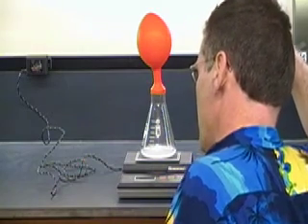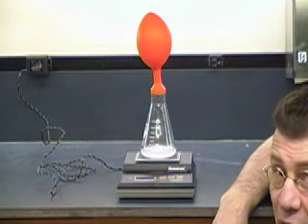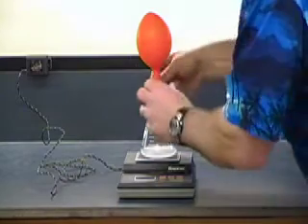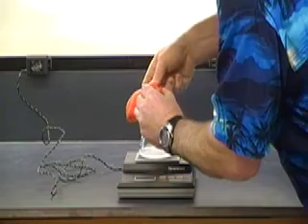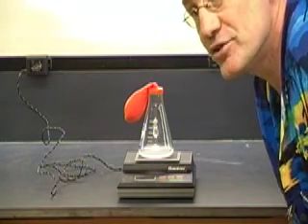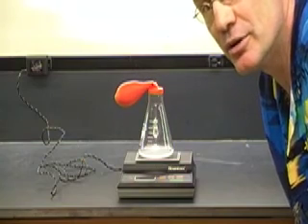Oh my gosh, it's 132.1. It didn't change. Is that what you expected? Now I'm going to let out the gas here, and what do you think is going to happen then? Okay, so all we lost there was the gas, and now it's 131.6. Interesting. What do you think that means? Why don't you write that down and make sure, of course, you fill out your data table. Good luck.